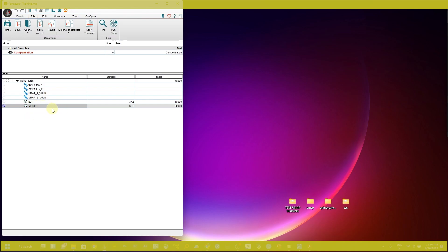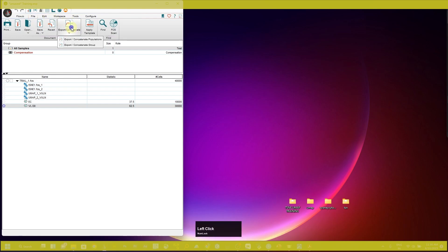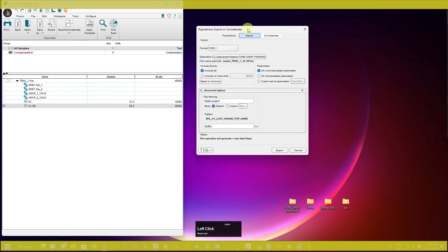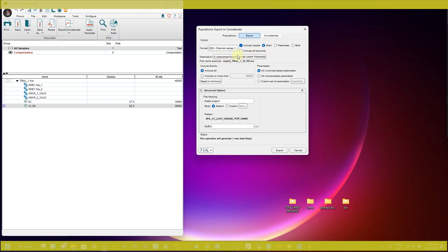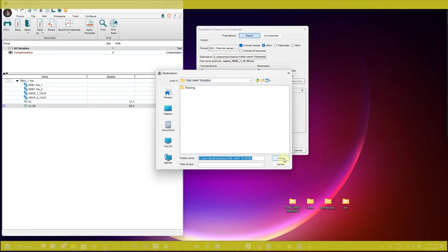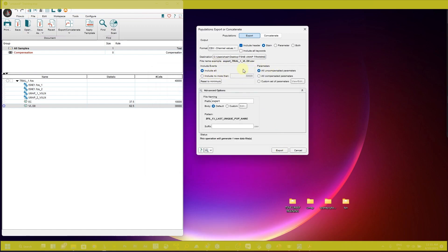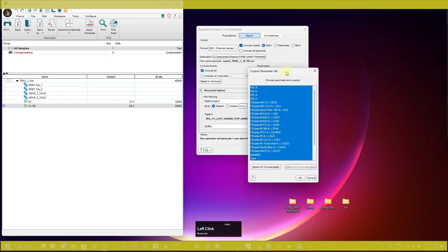Now I'm going to show you how you can export the data file from the FlowJo software to transform your t-SNE or UMAP plot using the R script. I am selecting the VLD0 group first. Go to File, Export, and click on Export. In the output format, you must select CSV channel value — this is very important. Then select the destination folder, include all events, and for parameters select a custom set.